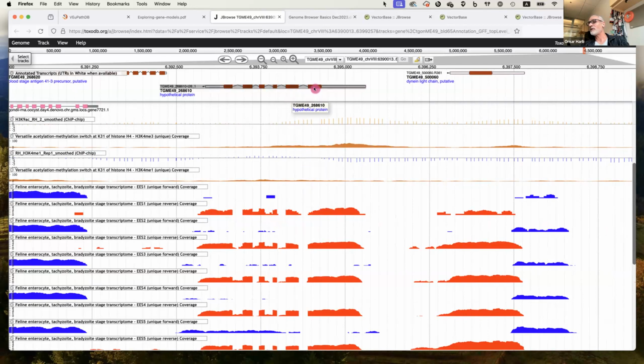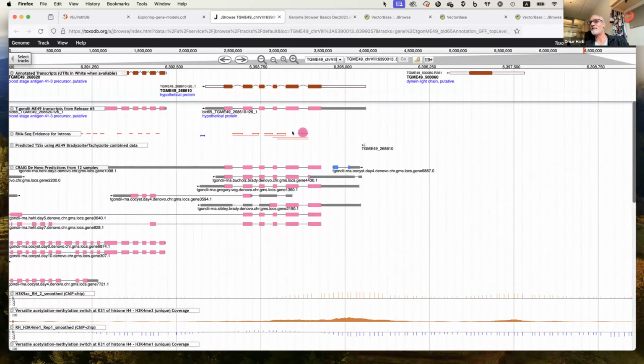Because the reads are coming from spliced genes, where there are no introns in the messenger RNA, you're going to have some reads that are spanning this intron when you map them back to the genome. And that's where this evidence is coming from. So anytime you get a read that had to be split to map it appropriately to the genome, that's basically read evidence for the existence of an intron in that region.